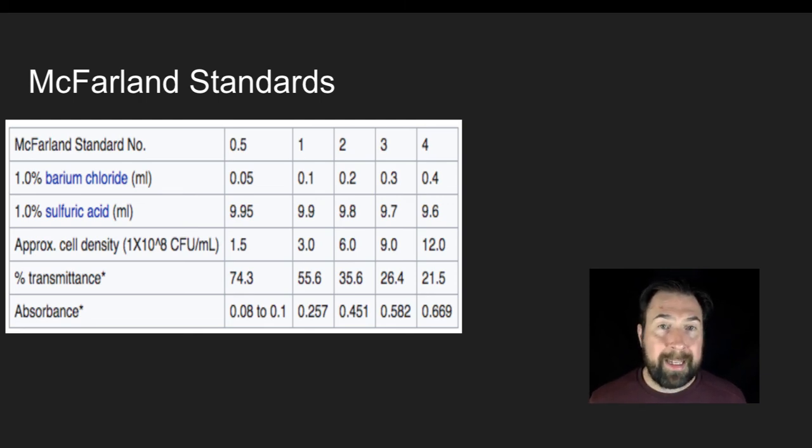And this gives you some ideas about how to go about collecting data if this is the experimental setup you're going to use. Please ask me or your teachers about any questions that you have as you're setting this up, and I will talk to you soon.